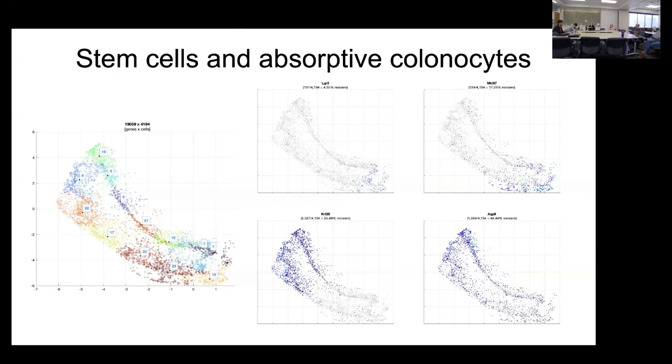But for the colon, I just haven't been able to do that. So this is what I have to do. I just have to look at the expression across these figures here and then try to label these clusters here as a specific cell type. Again, this isn't finished just yet. I need to input a lot more details into this so that somebody can actually follow it. But for the most part, this is how we identify cell types in the colon.